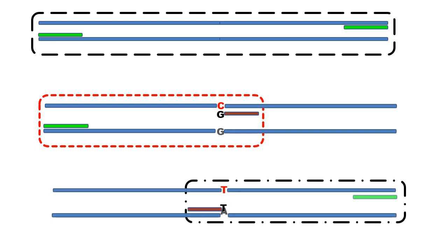This is another DNA molecule having the T allele, to which two primers will get attached. The outer reverse primer, which will get attached to the forward strand, and the inner forward primer that will get attached to the reverse strand. And the black dotted rectangular region shows the region amplified by these two primers. Hence, on the basis of this, we will recognize the product size.